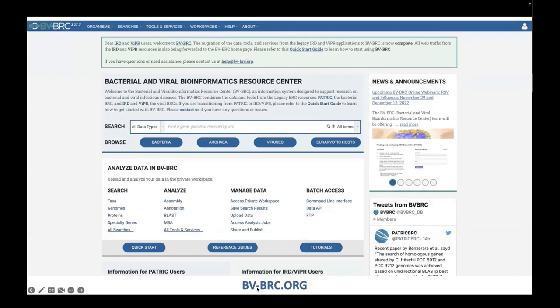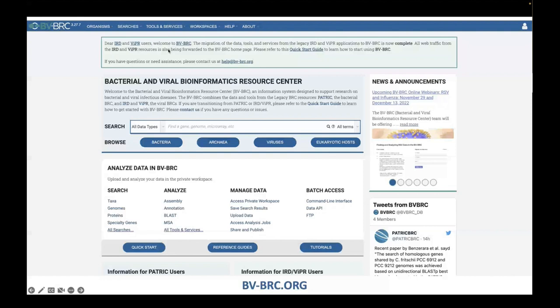If you go to bv-brc.org, you'll get to our website and can access data on bacteria, archaea, and viruses. We also have some information for eukaryotic hosts for analyzing things like RNA-seq data. If you're going from IRD and Viper, you'll be automatically redirected to the BVBRC these days. You can still find the legacy sites by clicking on IRD and Viper, though some tools from IRD have not yet been migrated.